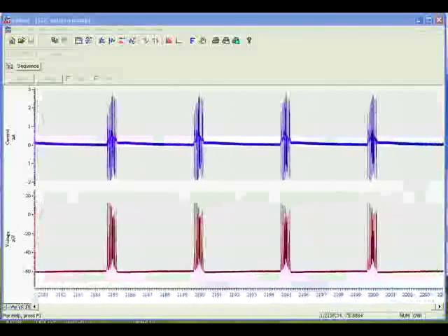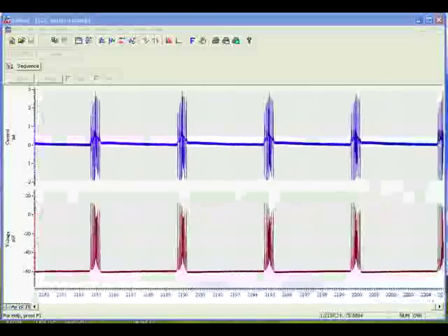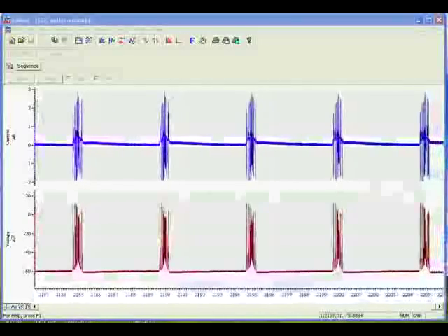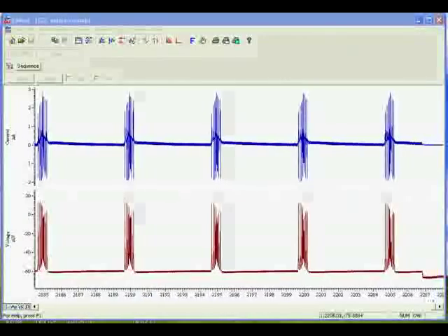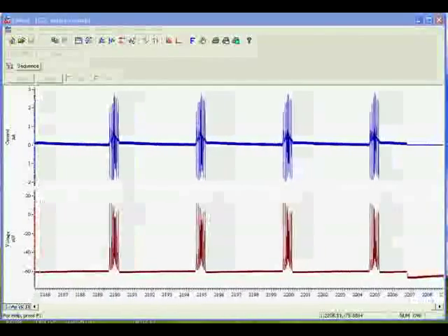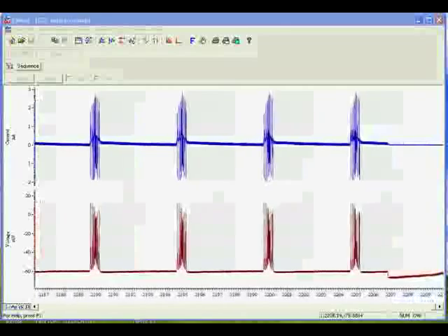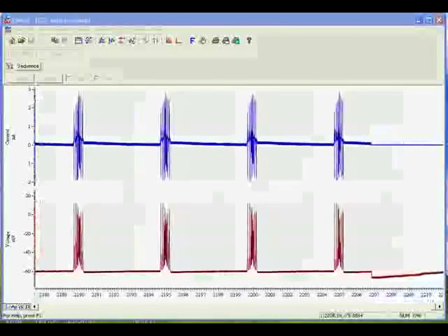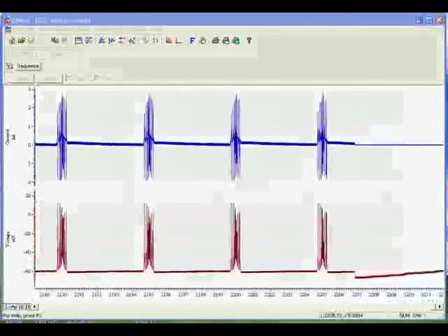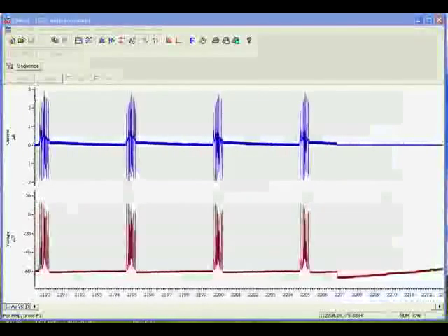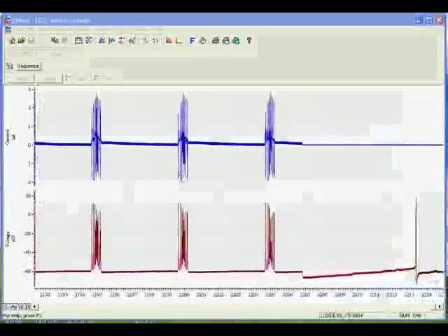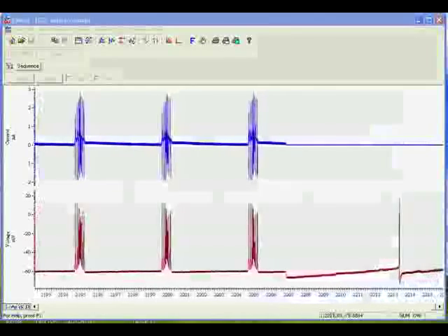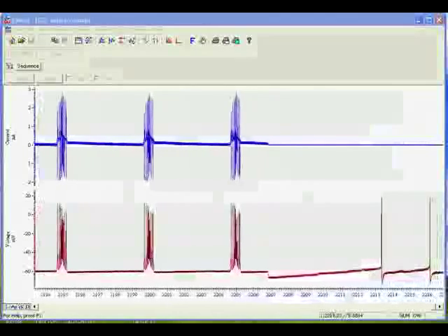So if we turn that off now, you can see that the cell fires happily on its own and returns to its regular firing rate.